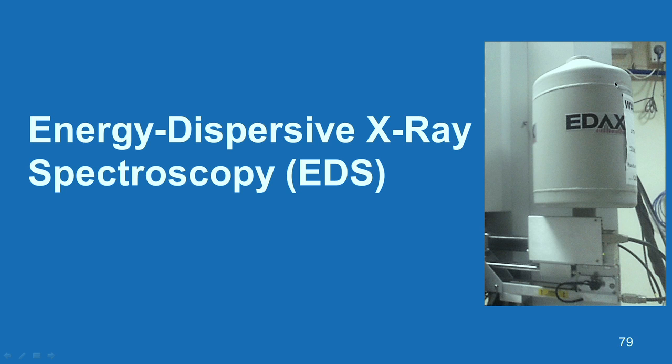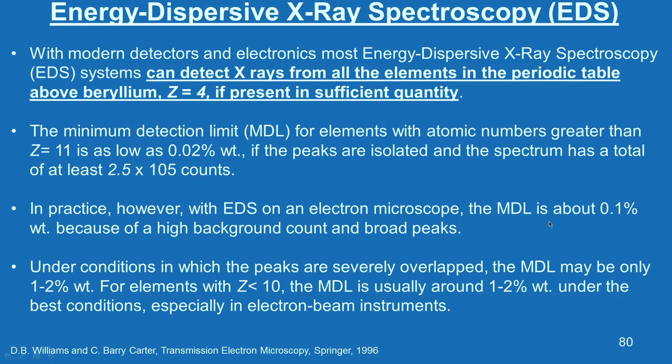So, the first one I would like to take up is energy dispersive X-ray spectroscopy, called EDS. The photo which is shown is from our lab, which is an interface with an electron microscope. So, first look at the introductory remarks.